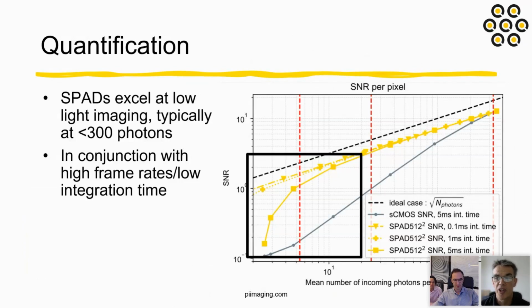The question was specifically about ICCDs and tuning the sensor to move that QE from UV to IR. ICCDs operate with a photocathode, and they enable you to just swap the photocathode to change the detection range. So they do offer UV, visible, and also near infrared. The same holds for SPADs. One can build SPADs for UV, for visible, and red. In our company, we are focusing on visible.